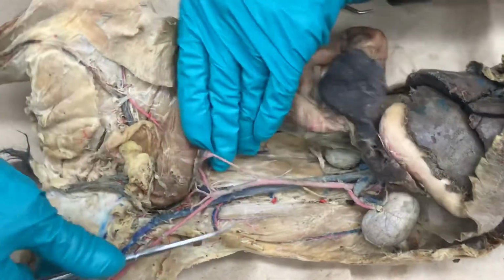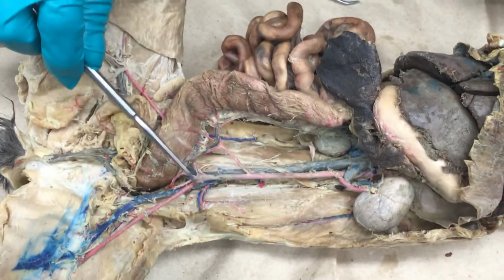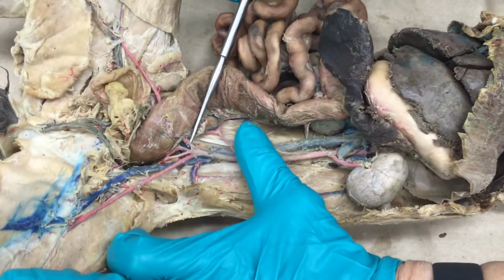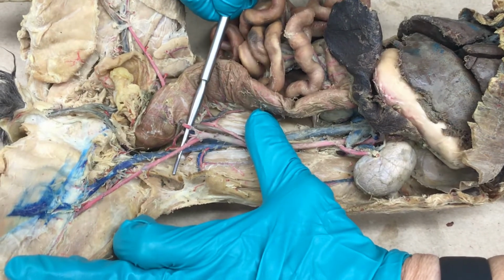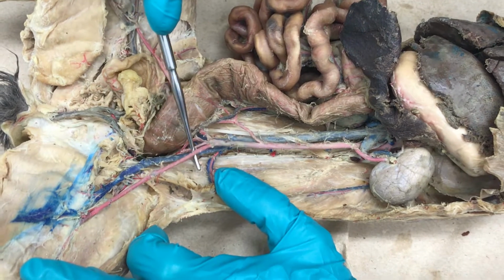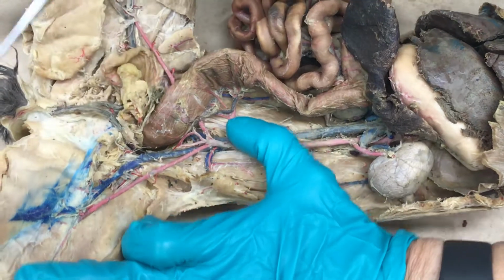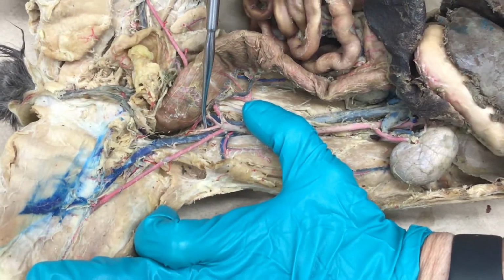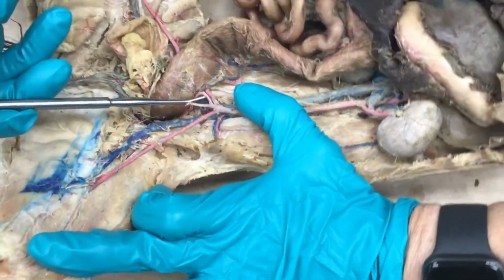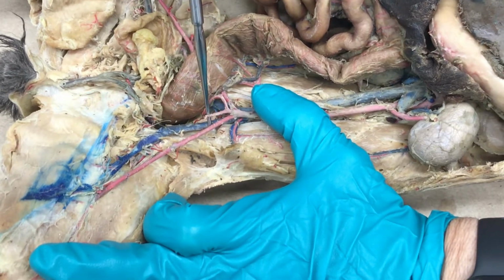All right, now we're going to get down here. We're going to reach a fork in the road. See how that abdominal artery branches off? It goes down the left leg, then it goes down the right leg. These first two divisions here on the right and on the left are called the external iliac arteries. Left external iliac artery, right external iliac artery. Now you've got this little one here, it's broken, but that would be the left internal iliac artery. And this is the right internal iliac artery. Look at the pictures in your lab manual. You can see them really well.